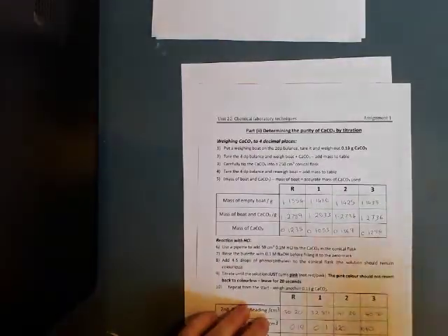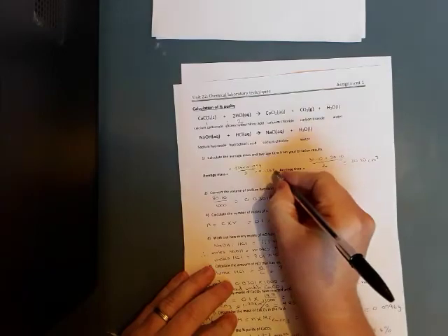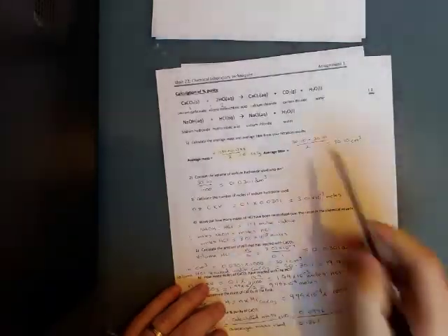we're just going to do number 1 here. So we have to calculate the average mass. So the 2 masses I'm using are from this one and this one. So we add them together, divide by 2, and that gives us 0.1267 grams. And of course, we're going to be using this titer and this titer result. So it's 30.10 plus 30.10 divided by 2, of course, gives us 30.10.